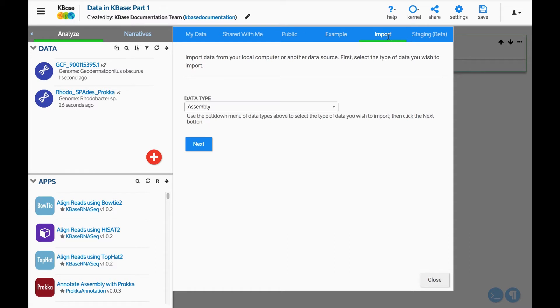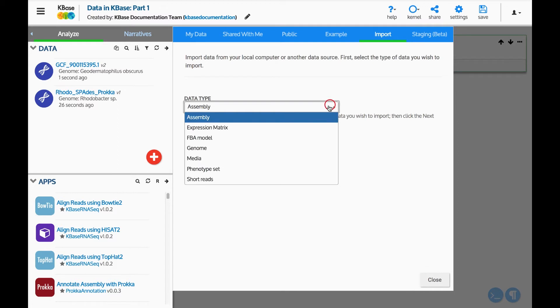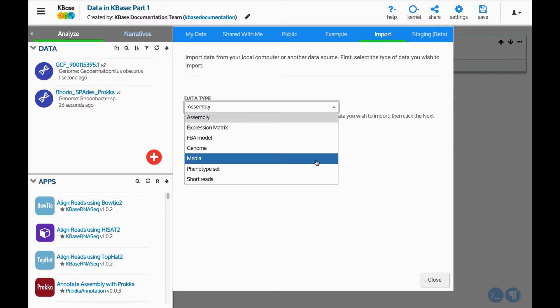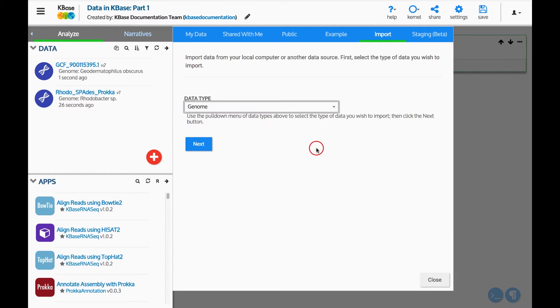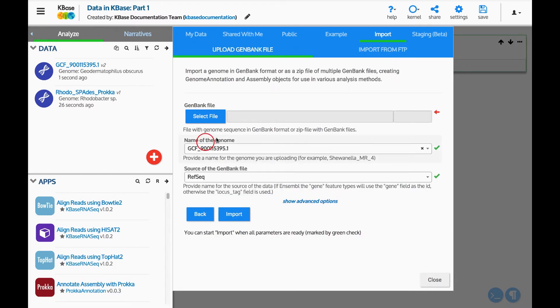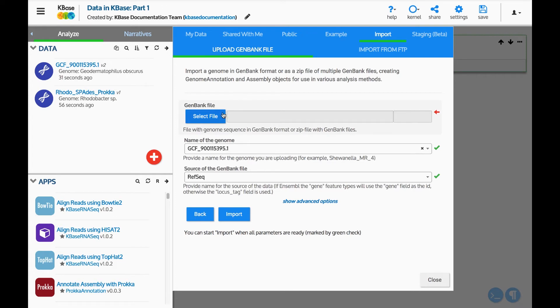Use the Import tab to upload data from a computer into your narrative. Use the drop-down list to select the type of data you want to import. Let's add a genome. For this example, we will upload a GenBank file for an E. coli K12 genome from my desktop. If you want to upload a GenBank file from an FTP site, choose the Import from FTP tab.